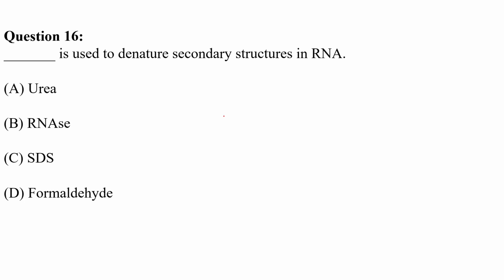Like in case of protein, we were denaturing the proteins with SDS. In this case, we denature the RNA with formaldehyde so that it can open up and it can be separated based on its molecular weight. Okay, so it is very similar to SDS-PAGE. Why we were using SDS in case of protein separation, similarly we are using formaldehyde in case of RNA separation.